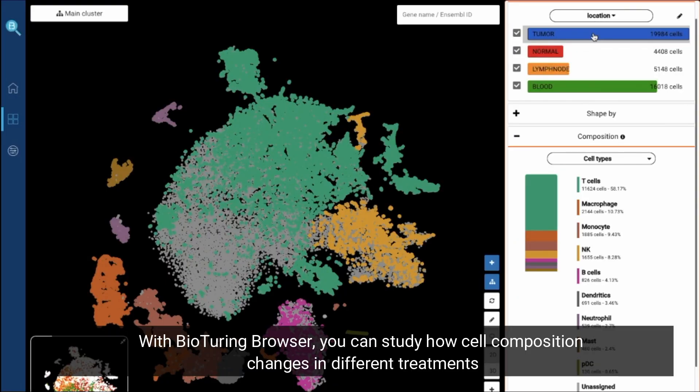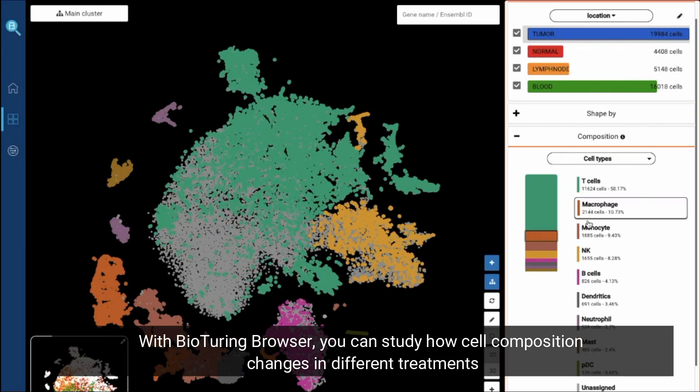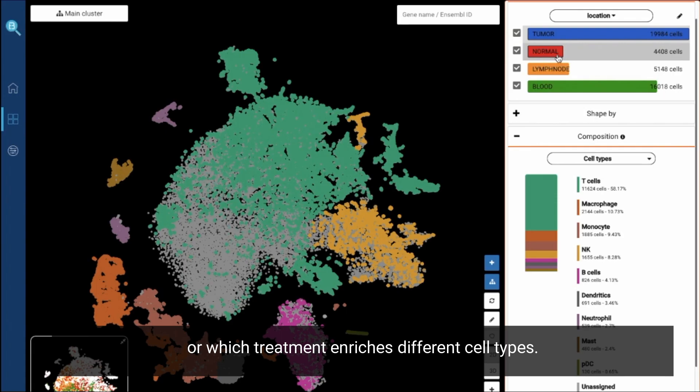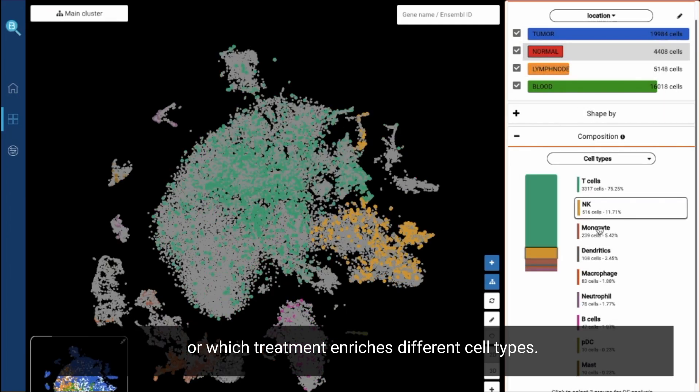Study cell composition. With BioTuring Browser, you can study how cell composition changes in different treatments or which treatment enriches different cell types.